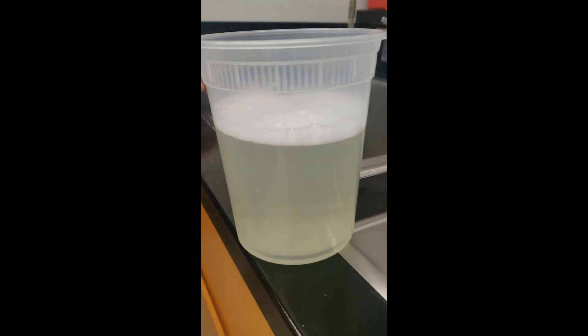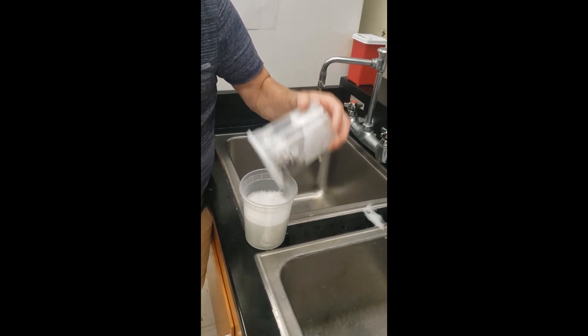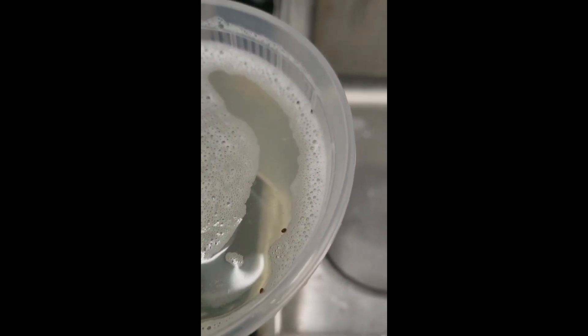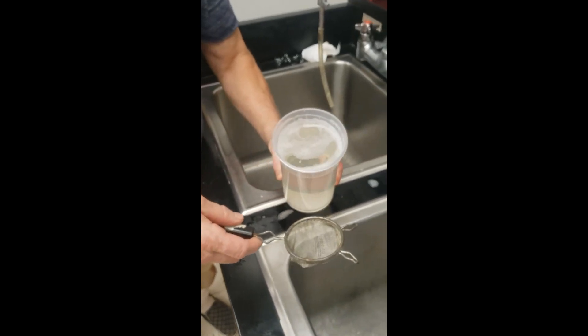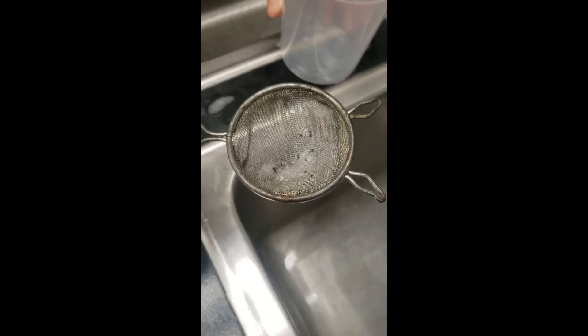Now we let that settle so the Varroa can sink to the bottom. Dave's going to pour it quickly from that screen into the new container and give it a good shake. Most of the time Varroa will sink to the bottom — you can see some at the bottom here — but every now and then they'll stay at the top near the foam. However, we can still collect these Varroa using this little sieve or strainer, available at the dollar store. Just pour all the contents right through, and there are the Varroa from the wash.